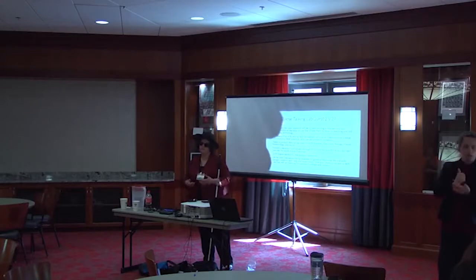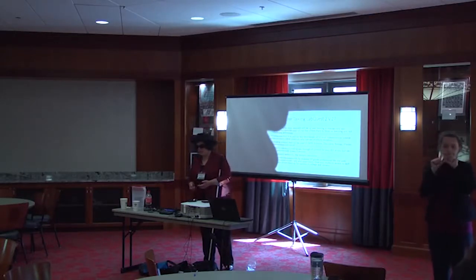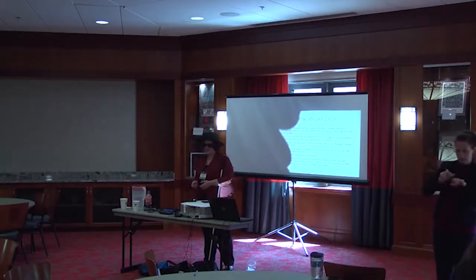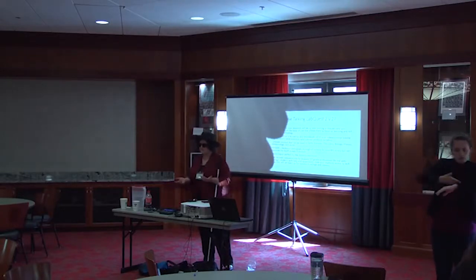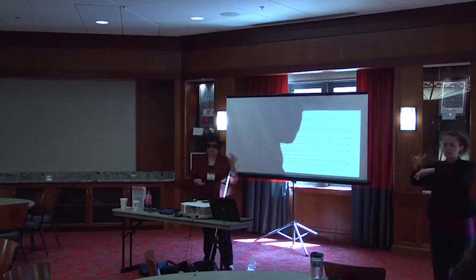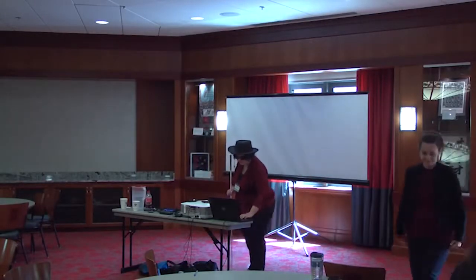How many sensors can you connect at one time? If you want to visually look at it, I wouldn't suggest putting over 4. If you don't want to visually look at it, you can put up to 12. Okay, so if you don't care what it looks like, then you can do that. There are 4 ports for it.